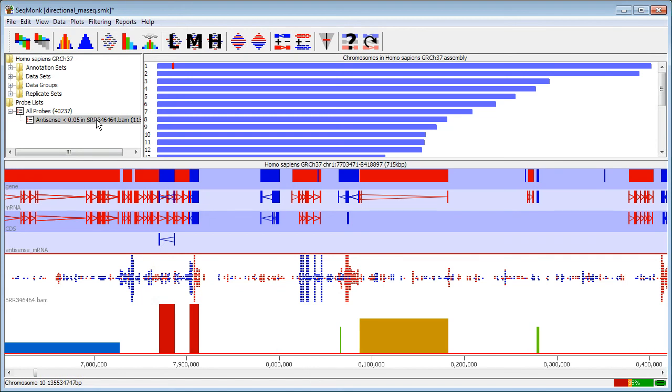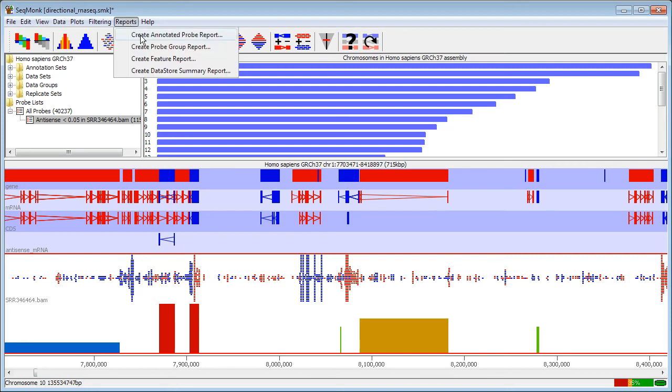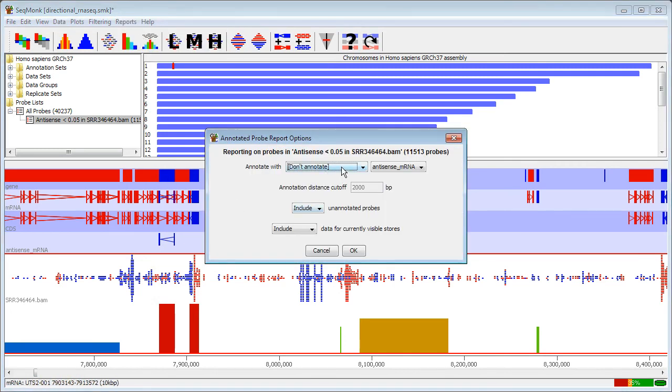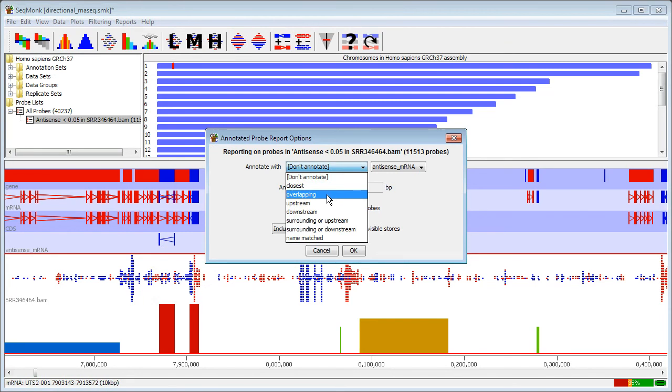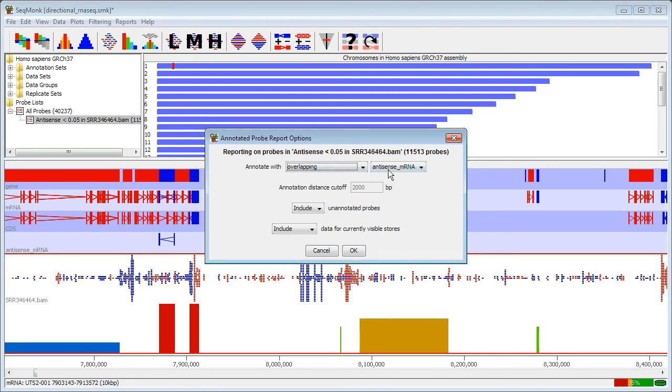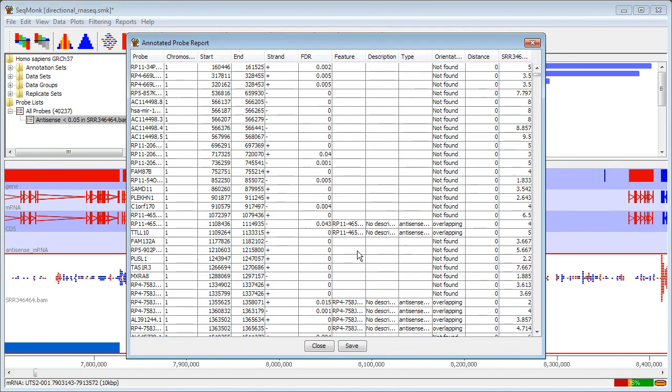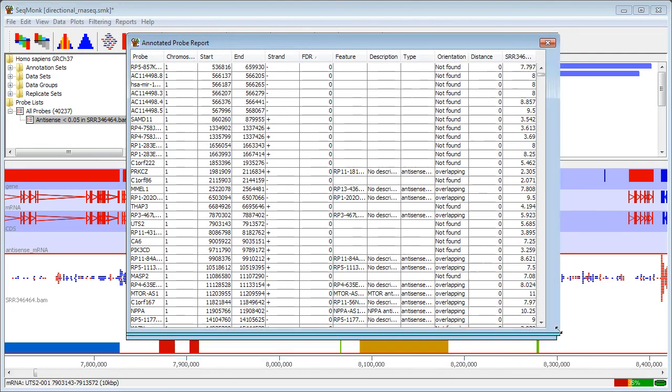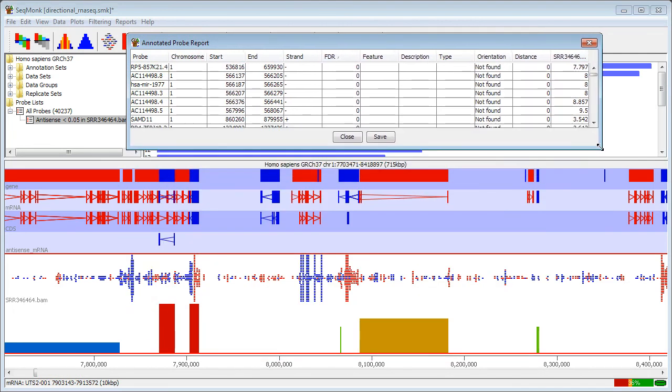So I can look at just the significantly antisense transcribing genes. To get a summary of what I've got, I'm going to create a report from this and I'm going to annotate it with any overlapping antisense mRNAs, so known annotated antisense mRNAs. I can also then sort my hits by the false discovery rate to try and get the ones with the most confidence.